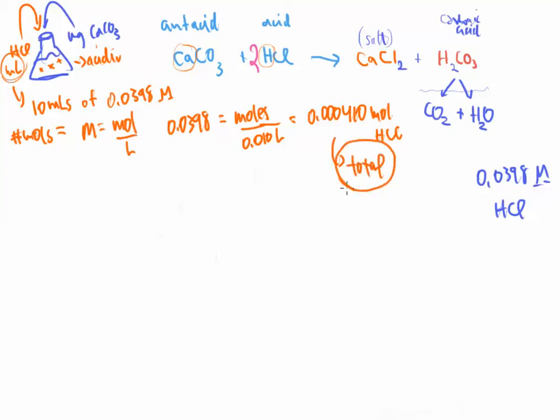Something's going to be about that total because he wrote it and he circled it. So what is going on with total amount? Okay, so this is acidic. I then took that flask that is acidic and I titrated that flask with NaOH.